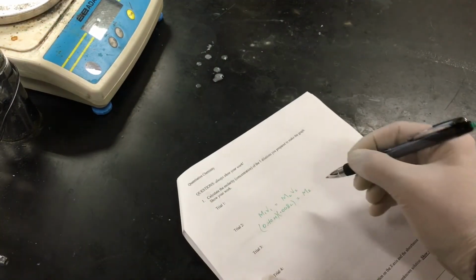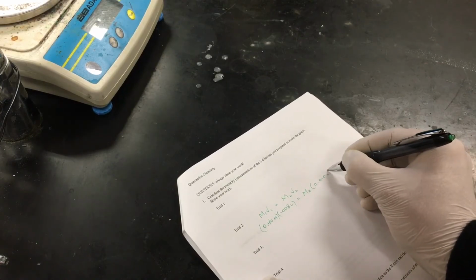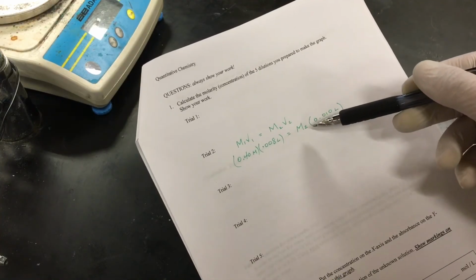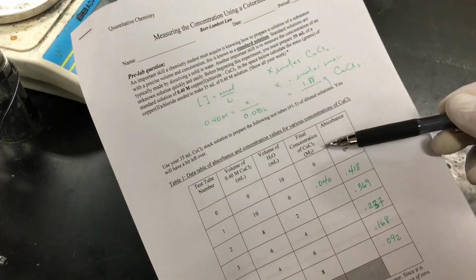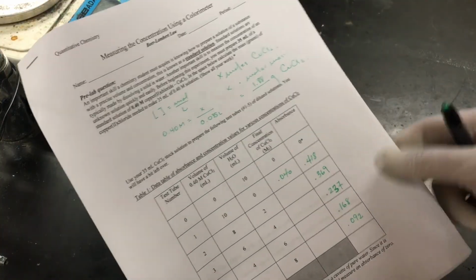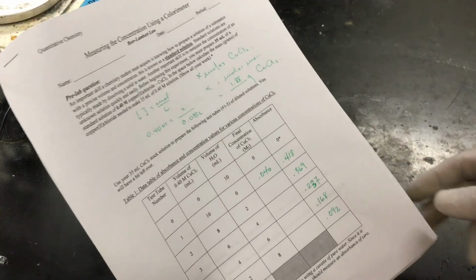So volume 2 is 0.010 liters. And then we solve for M2, which is the final concentration. That's what we're looking for right here, M2. You repeat the same calculation for all the test tubes, and then you have your concentration, you have your absorbance, and you can make your graph.